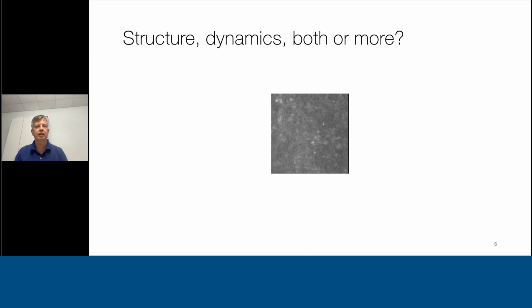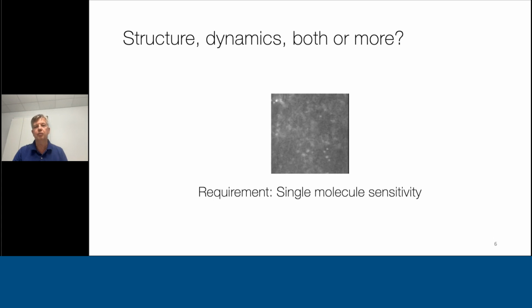And that is what I try to drive home. If you record with a light sheet microscope, you can record the structure and the dynamics at the same time, more or less recording in the same way.